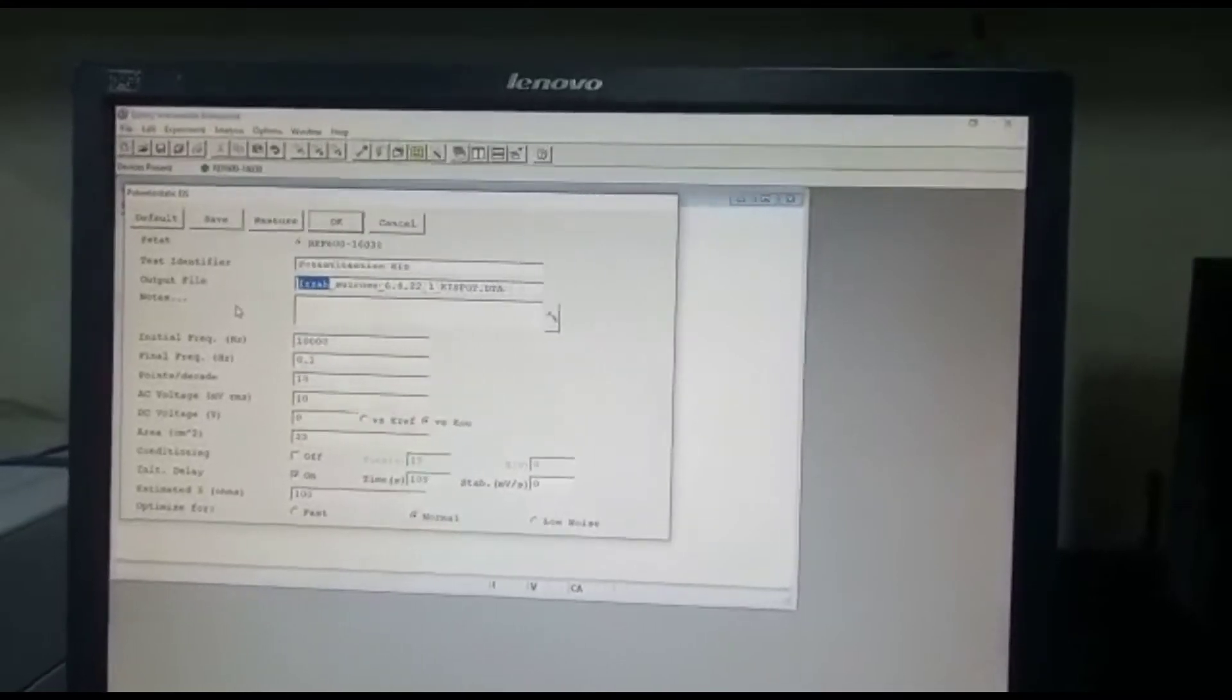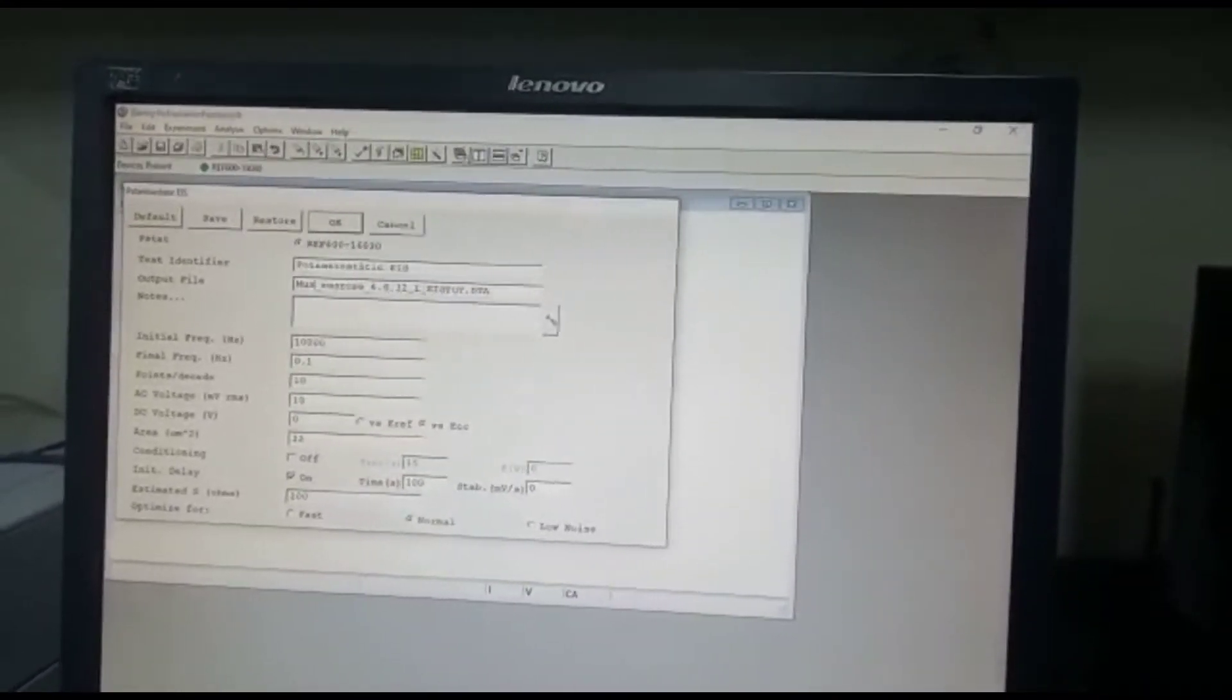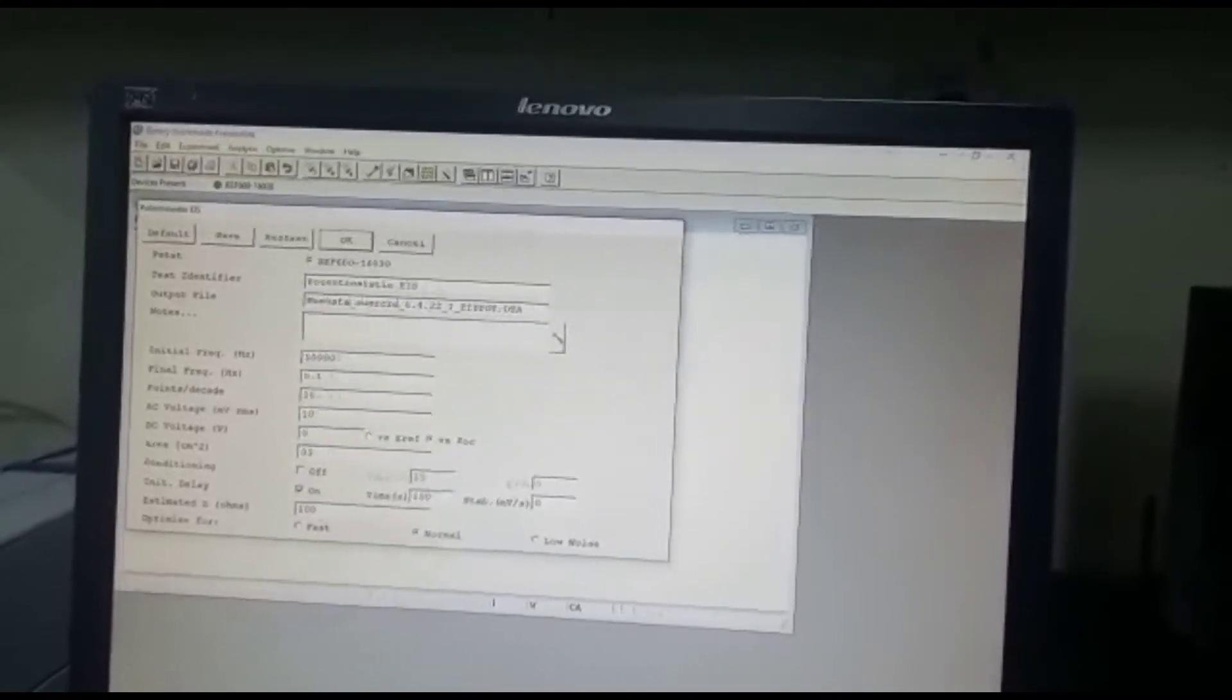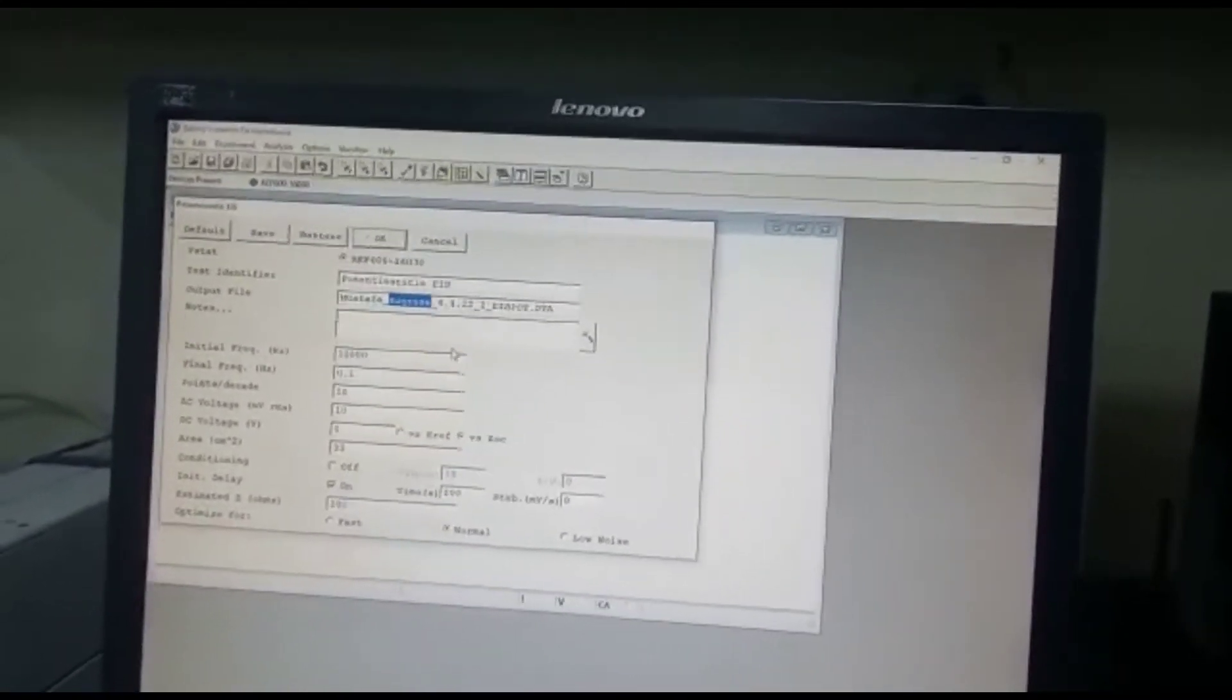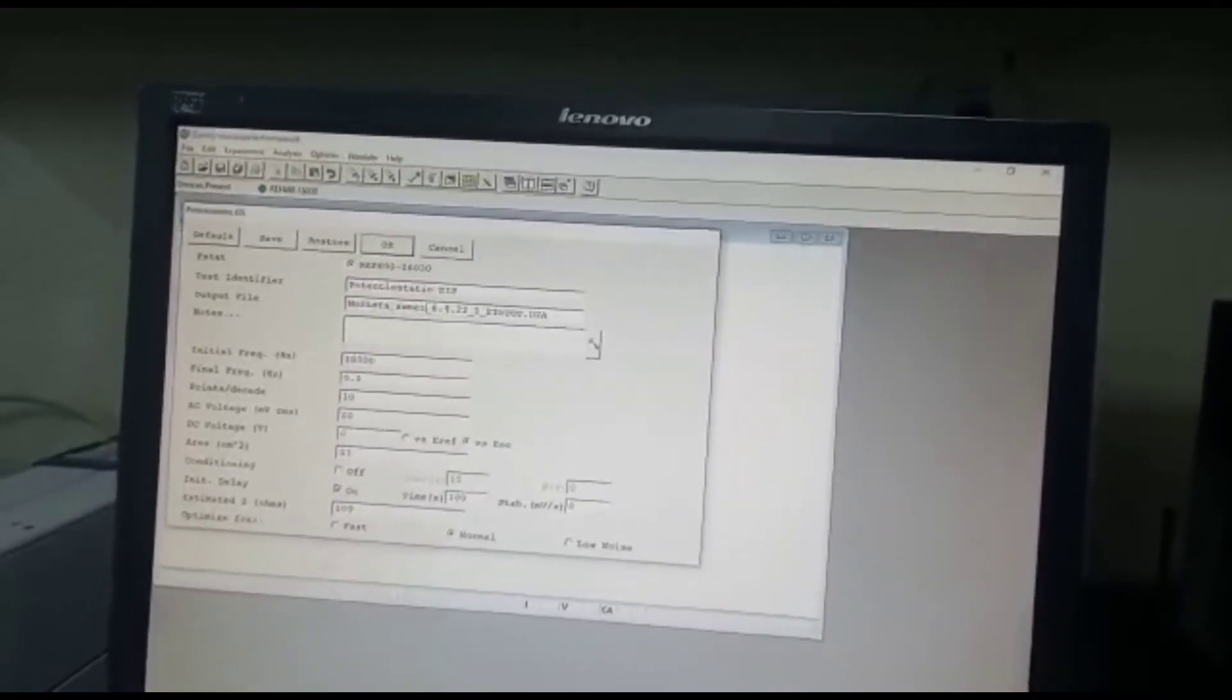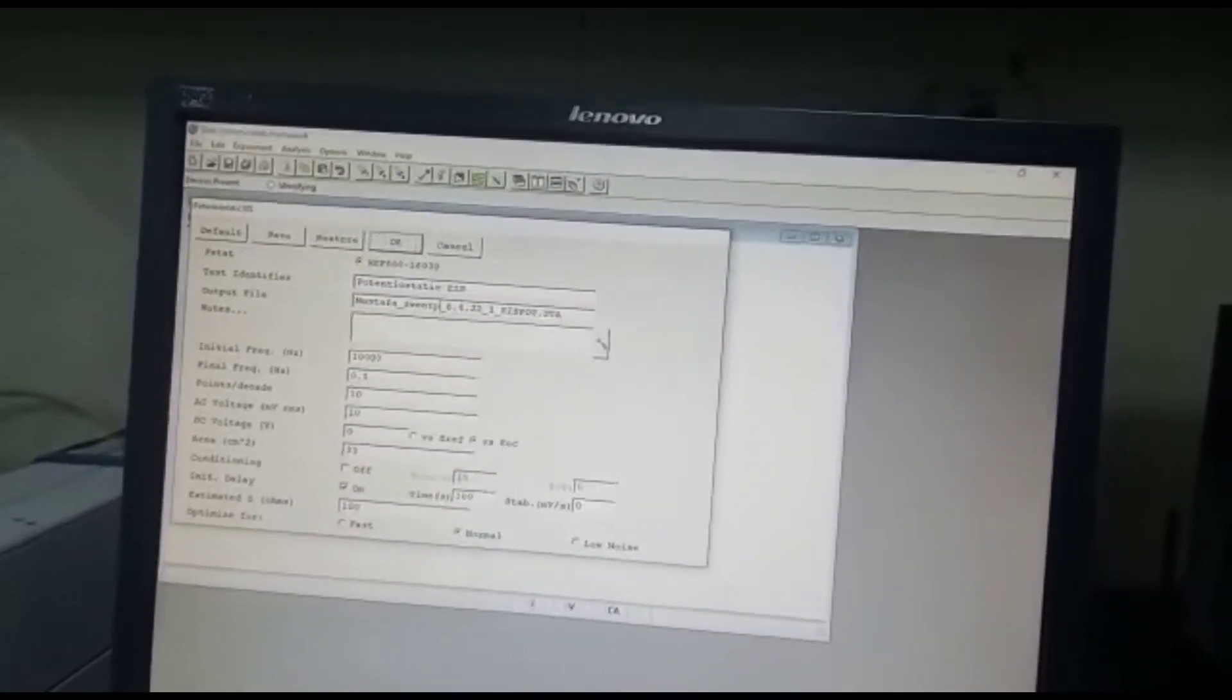Well, over here we are going to change the name based on the types of sample that you have. So I'm actually running one of the PhD student samples. It is actually a sweet potato waste sample.